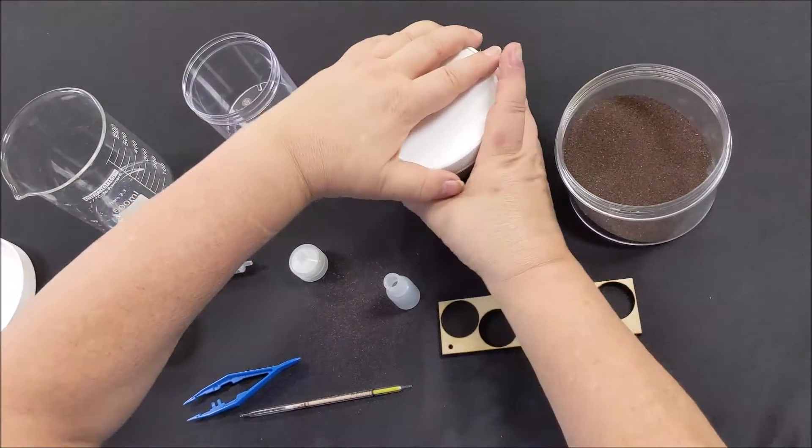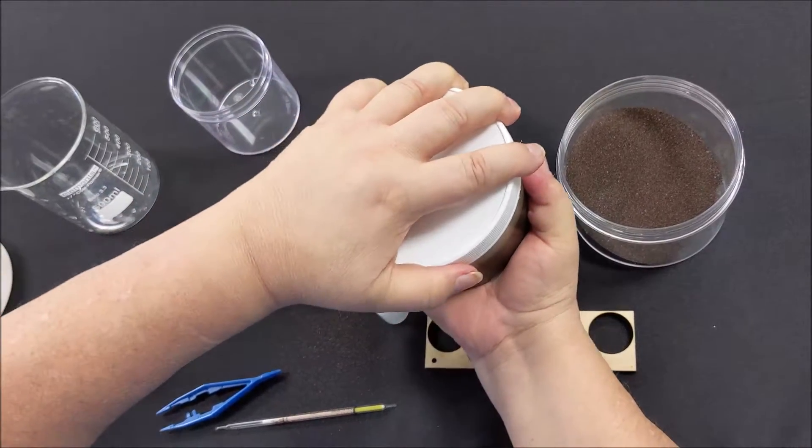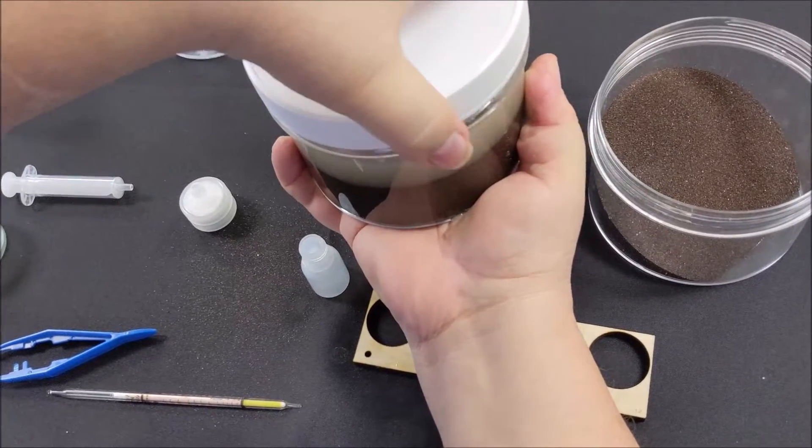Now extract 3 to 5 milliliters of the supernatant into the 5cc syringe provided. Using the syringe with the filter installed, put the 3 to 5 milliliters of water into the small container.